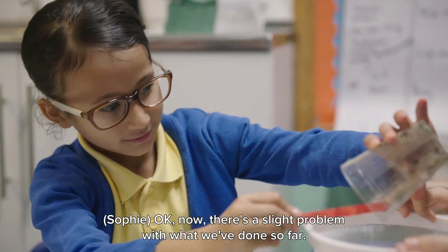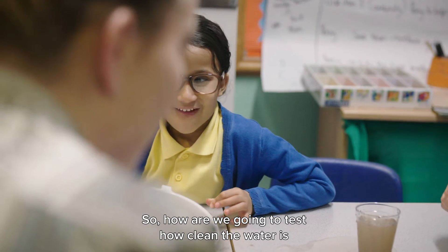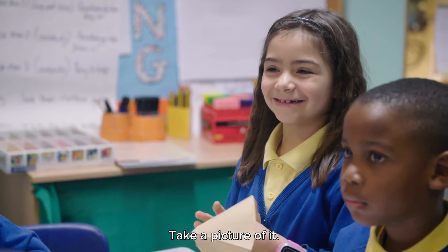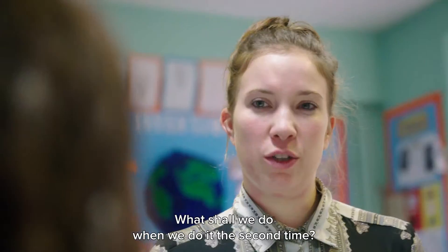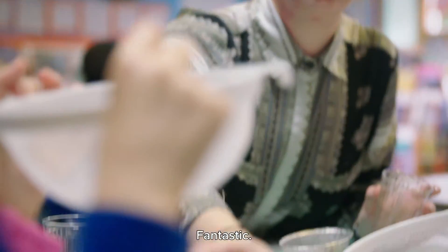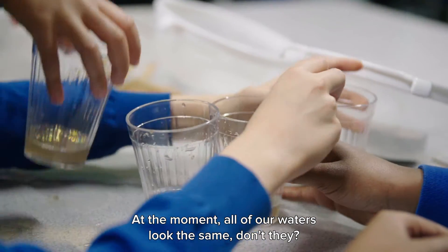There's a slight problem. What have we just done? We've poured all the water out! So how are we going to test how clean the water is? We've got nothing to compare it to. Take a picture of it — or what do you think we need to do to our investigation? Start again! Start all over again. So what should we do this time when we do it the second time? Not pour all of the water into the next cup — fantastic!